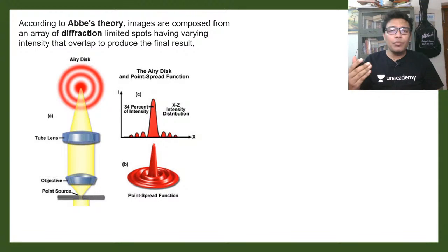And all of these spots would have different intensity. Different intensity would give you different features, right? One particular image of a cell might have some, let's say, bright features, dim features, etc. But together these features would make sense, give you a contour or an overall shape, right? And the final image is basically the overlap of all of these features, okay? So that is your final image.